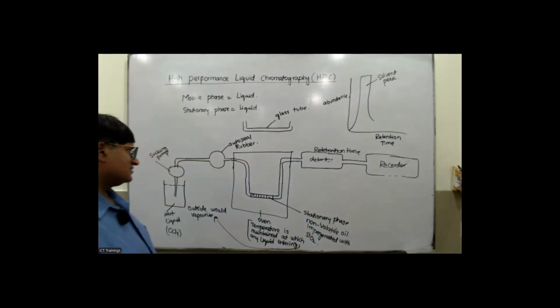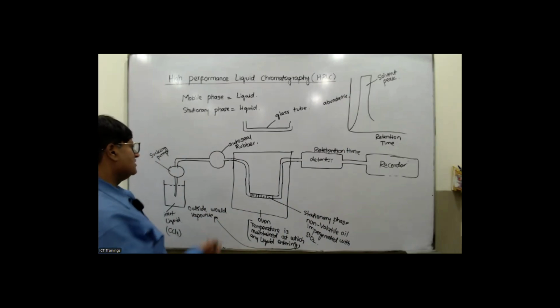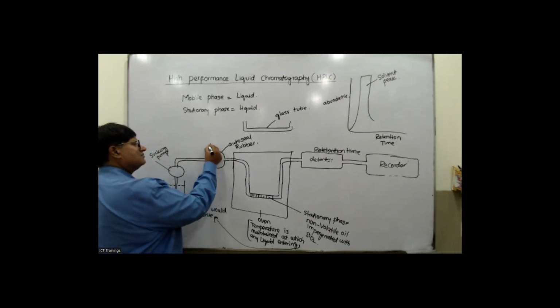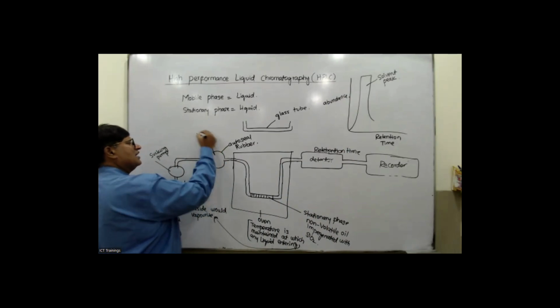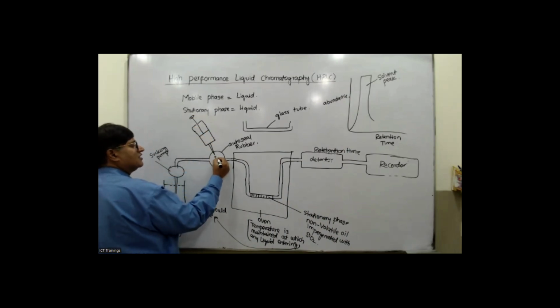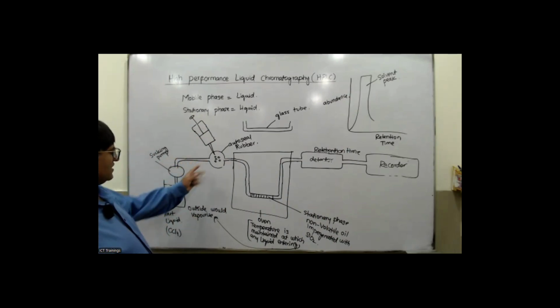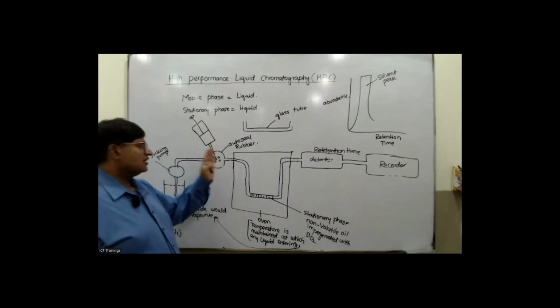Now what would happen, guys? Whenever you want to find out, let's suppose any sample like juice. Yesterday we had the juice sample. So in the same way, you should enter a little bit of the juice with the help of the plastic syringe up here. Okay, so you just push this plunger down, so the liquid droplets will come up here, juice droplets. Okay, so inert liquid is coming up here. So this one is going to push these liquid droplets into the oven.